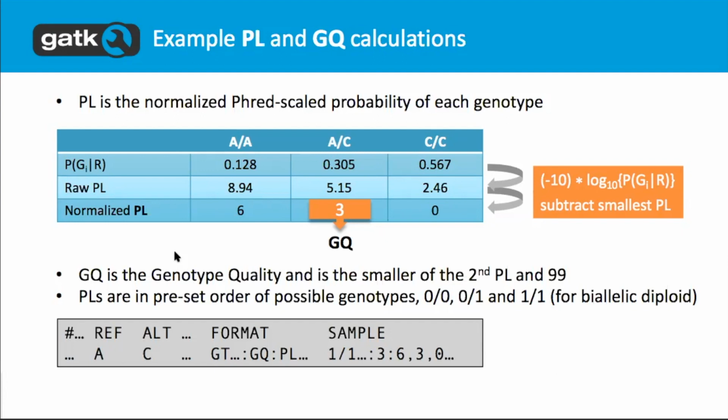Yeah, so there's some base priors about the heterozygosity and things like that. And that is something that you can set. It's based on the expected heterozygosity in humans, but you can set that if you're working with a different organism or a population that has a higher mutation rate or something like that. You can set that on the command line. So it's the same prior for every site.